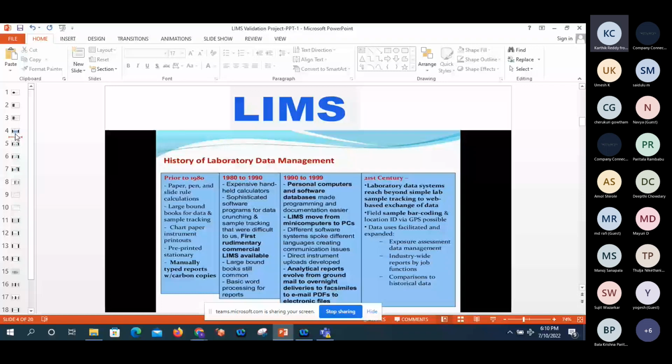So it's not believing the people doing the audits. So people are introducing it, and there are so many vendors available in the current industry, like Labware LIMS, Thermo Fisher Sample Manager LIMS, and Caliber. Nearly 20 to 25 are available. This comes under digitalization.